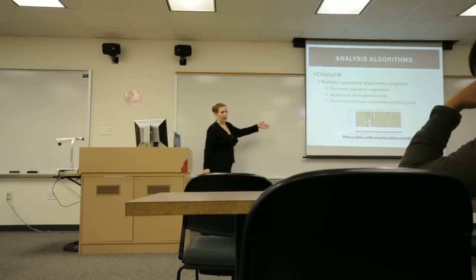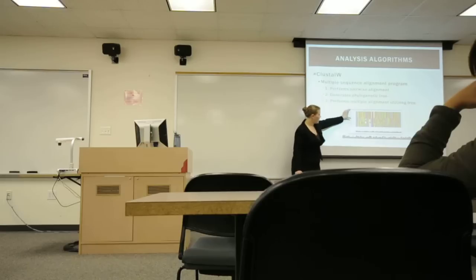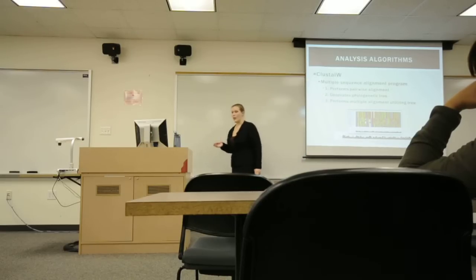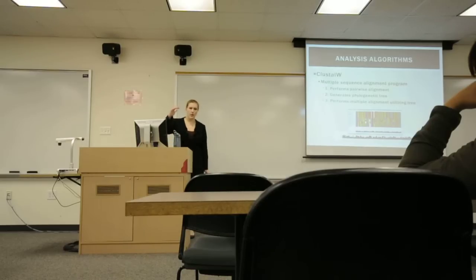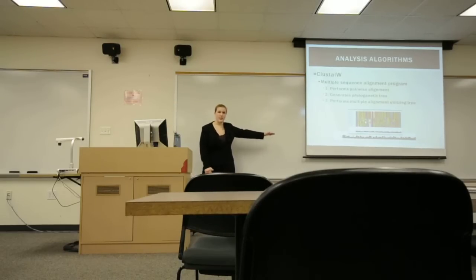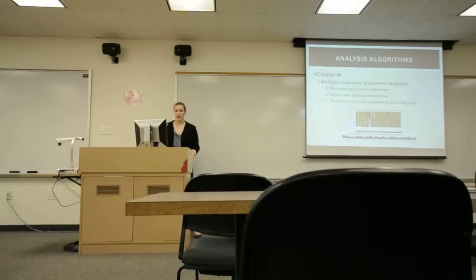This is an output of a Clustal alignment seen on JalView, which is kind of an add-on so that you can visualize the results. As you can see on this top portion, those lines of color are where all of the bases match. But towards the bottom, you can see that this alignment gets a little messy. And then at the very bottom is the consensus sequence, which is made of whatever base was most common throughout all of them, and the consensus sequence here is a little bit rough because the sequences are dissimilar.